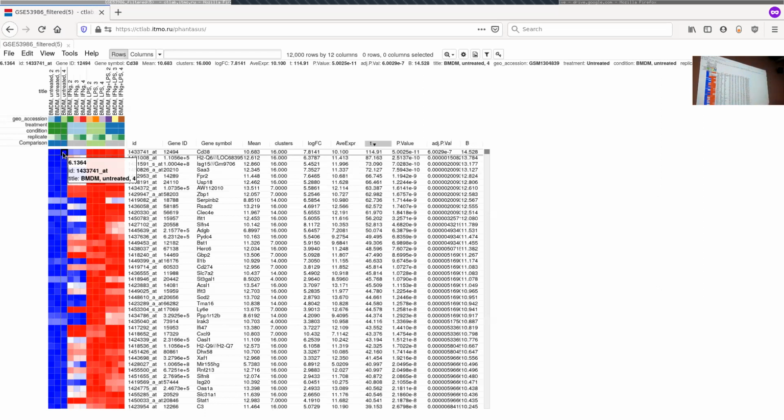There are other corrections as well, but in bioinformatics, especially practical bioinformatics, people don't really like Bonferroni because it's very strict. Particularly if you have 10,000 genes, it will effectively multiply all the p-values by 10,000, which is pretty strict.